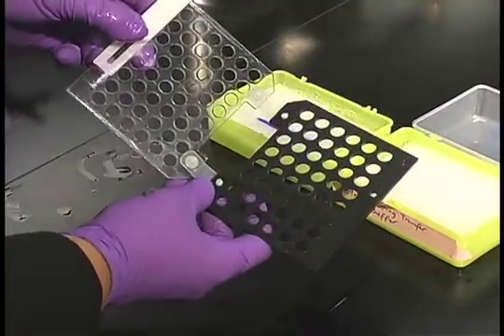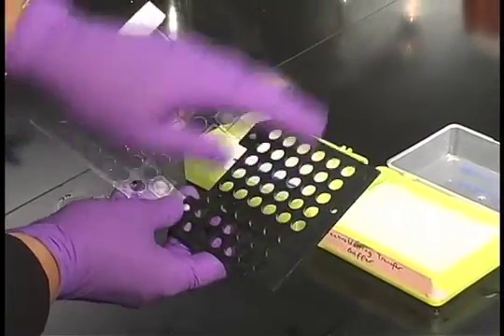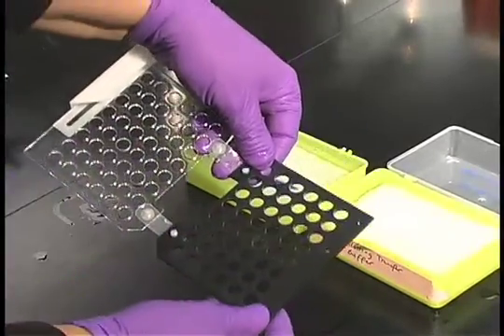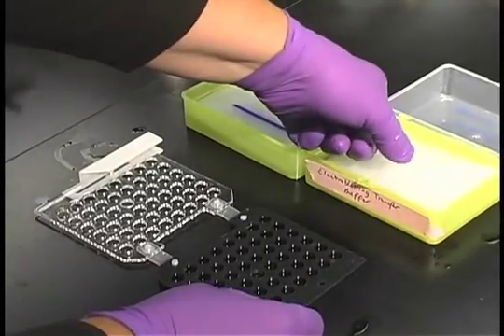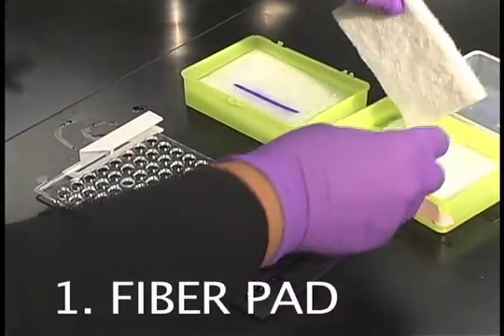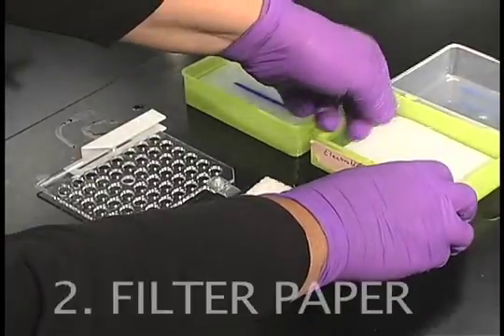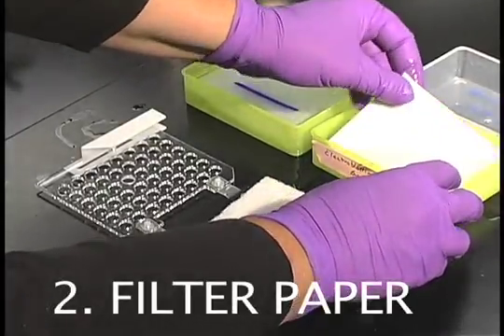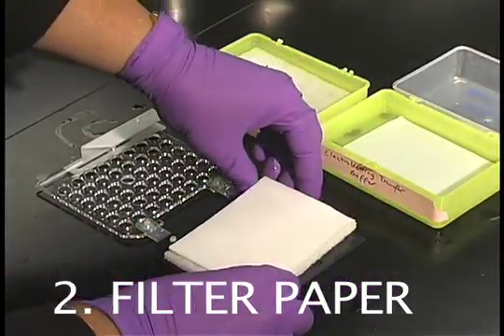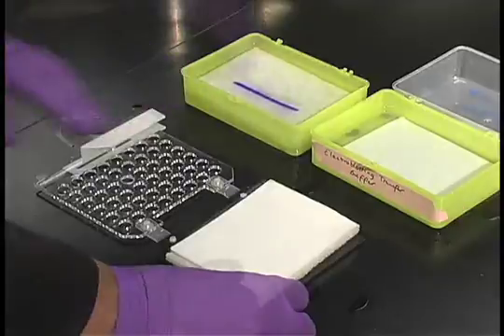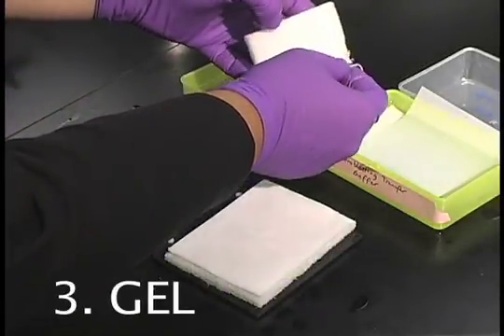When we put together our gel sandwich, make sure that you arrange this in exactly the right order. Put your black side of your gel sandwich cartridge down first. Put a fiber pad, then a piece of filter paper. After the filter paper, we'll put our gel in place.